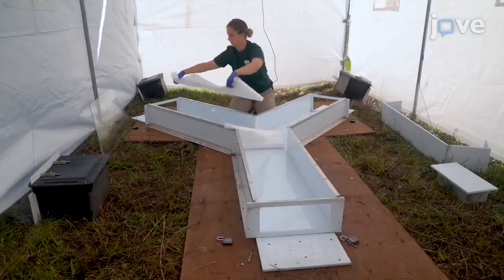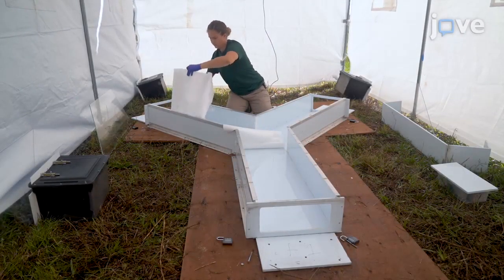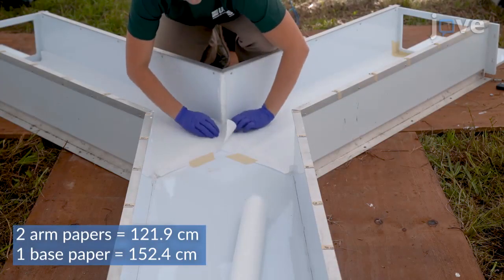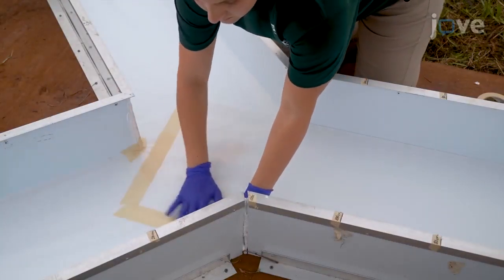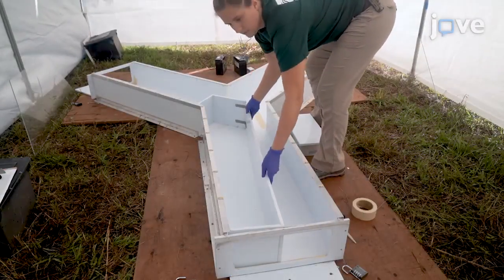Begin by placing new, clean scenting paper in the Y maze that is long enough to overlap at the junction of the Y and cover the entire bottom surface. Secure the ends of the papers near the boxes and the Y junction with masking tape. Install the partitions to block half of the base arm.